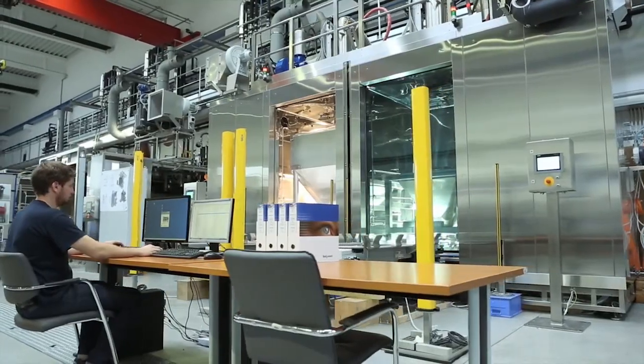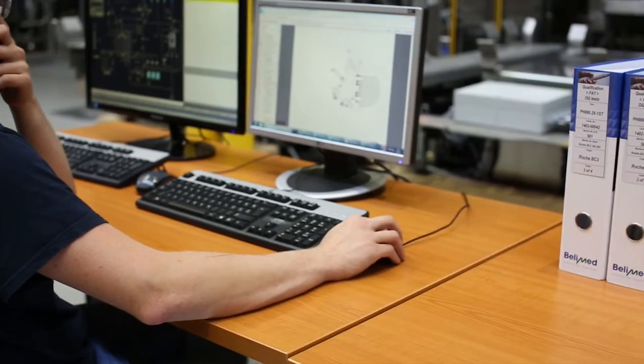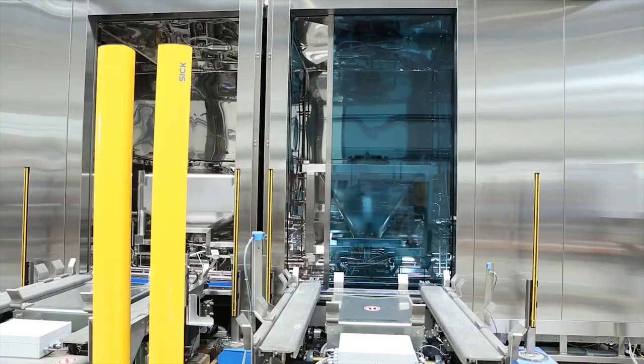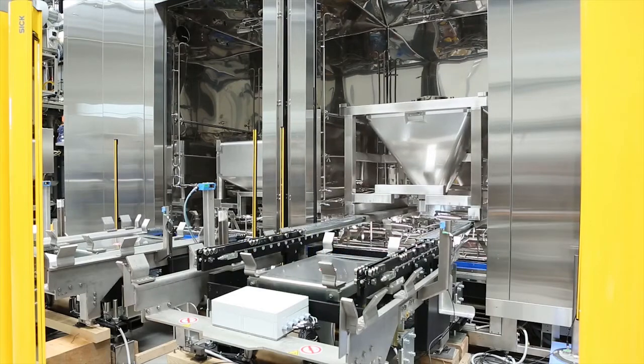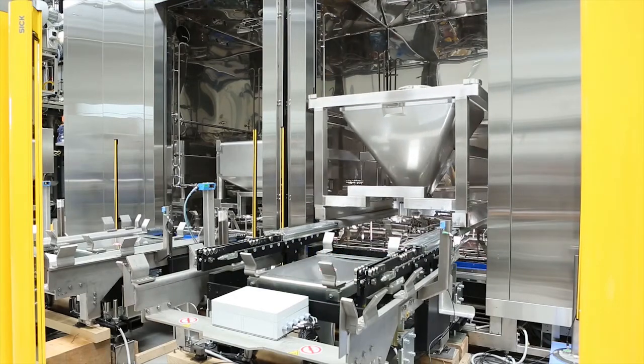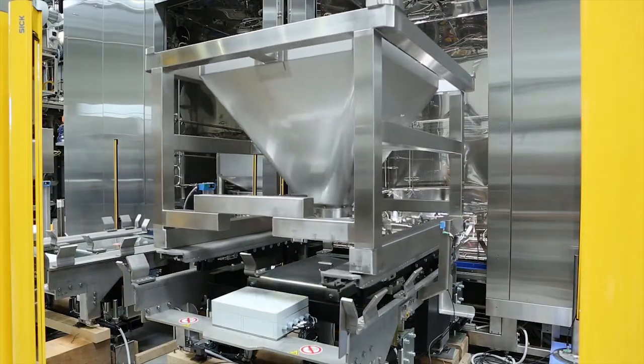The machine produces a batch report and either prints it out or sends it to the building side server. The doors open and the container is moved out of the washing chamber, where it awaits the user or HEV to pick it up and replace it with the next batch item.